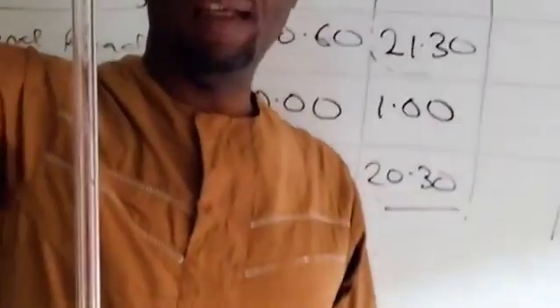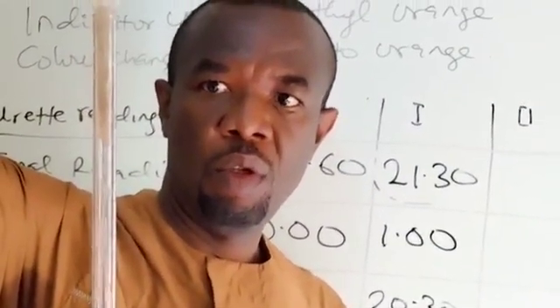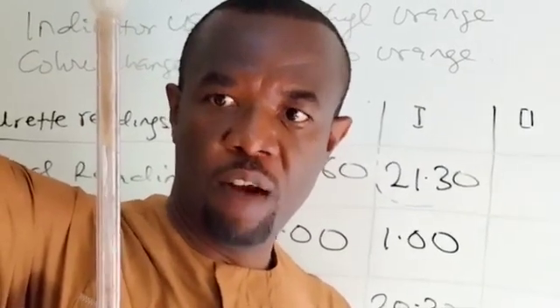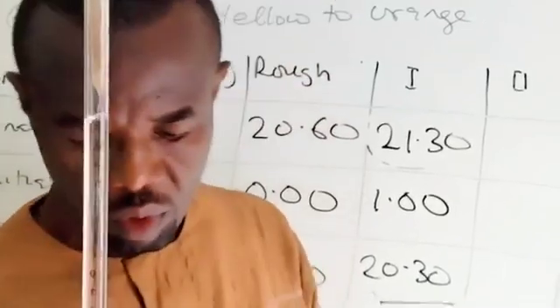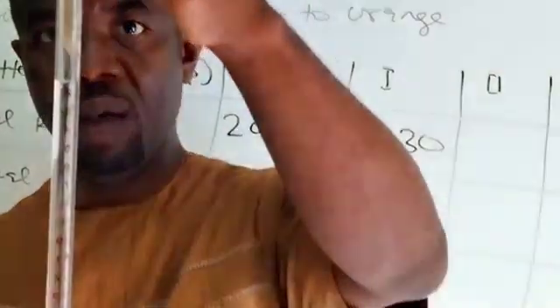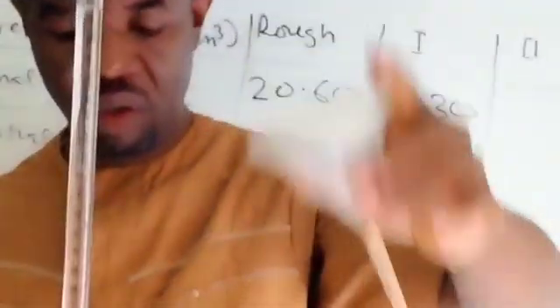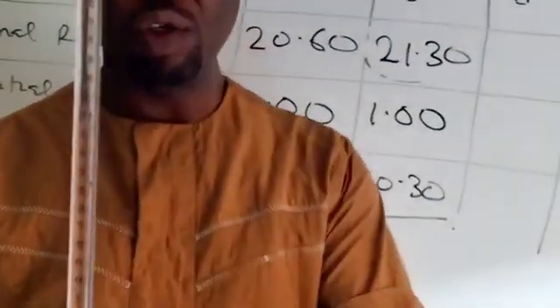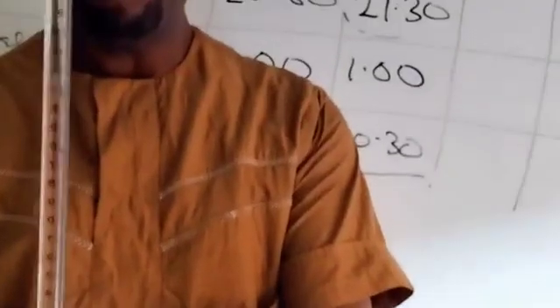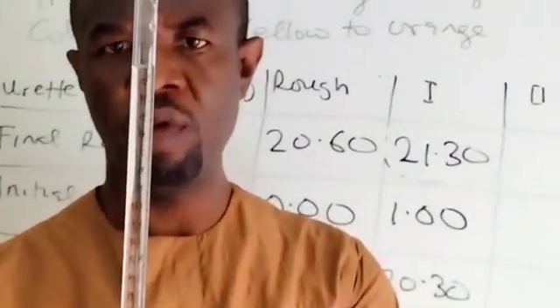So we're topping up the acid again for the second titration. So now I wish to start from 5, a whole number. Choose any whole number of your own convenience to start from. After you add the acid, remove the funnel. As a precautionary measure, the funnel should be removed, because if you leave it there, you're going to be adding additional drops of the acid. So let me adjust the acid to 5, a whole number, or we should start from 5.